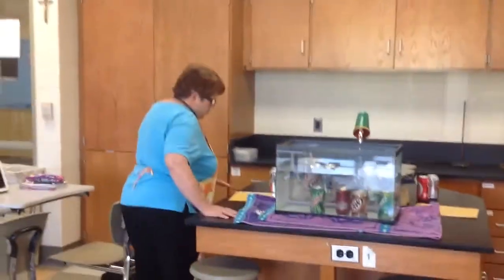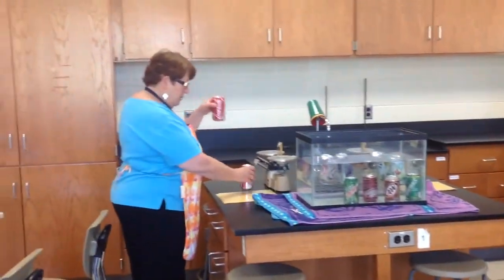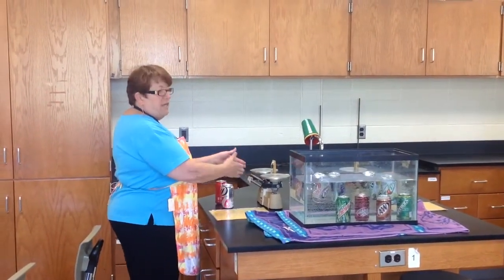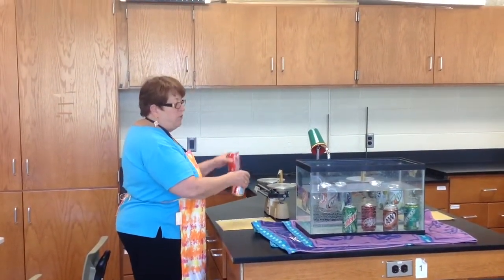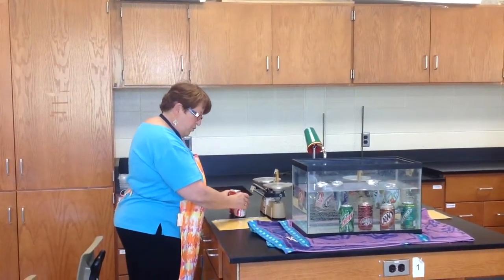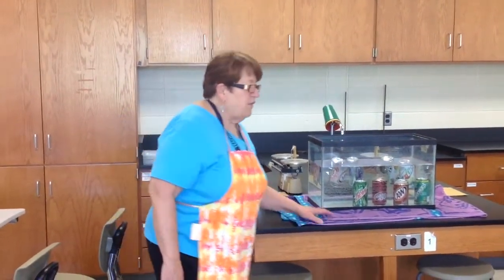When you get to number 7, it just says to put the regular Coke and the Diet Coke on the double pan balance. You are not moving the weights on here at all. You're not trying to find out what these weigh. You just want to see which one's heavier than the other, okay? Just put them on there, observe, take them off. All right, so follow that.